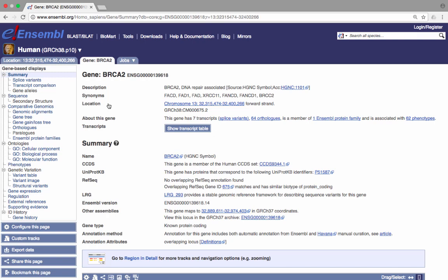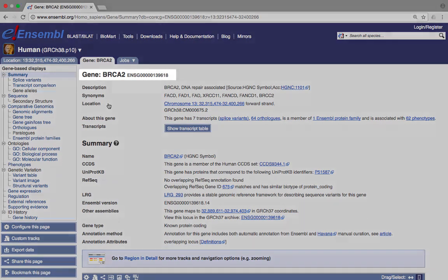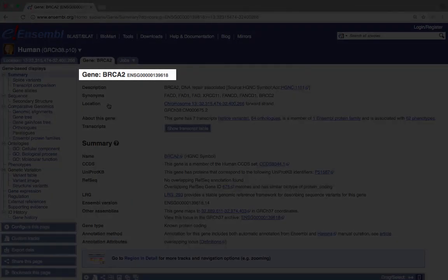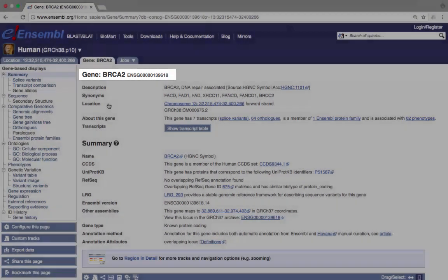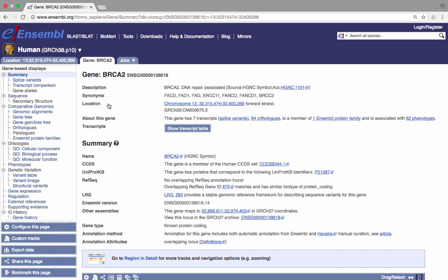The Ensembl gene identifier for this gene is ENSG00000139618. This is the stable identifier, meaning that even if this gene is updated, the ID should remain the same from one Ensembl release to the next. Other stable IDs in Ensembl include ENST for transcripts, ENSP for peptides, ENSE for exons, and ENSR for regulatory features.